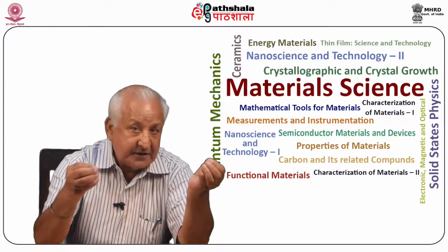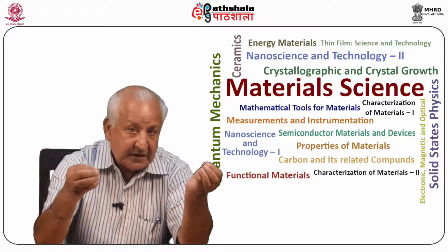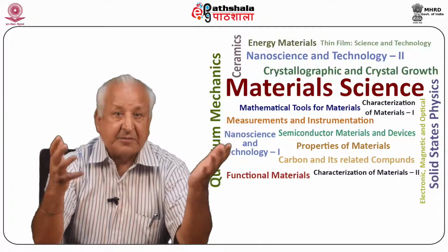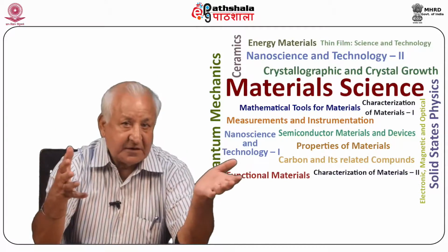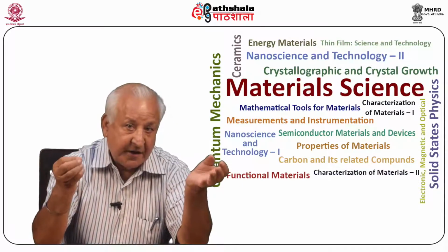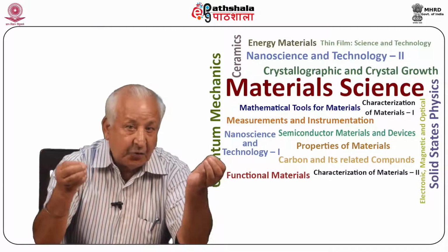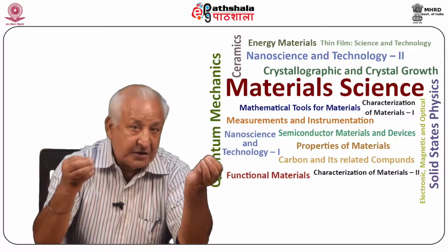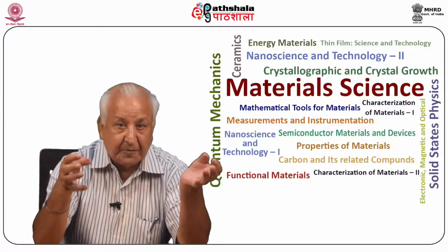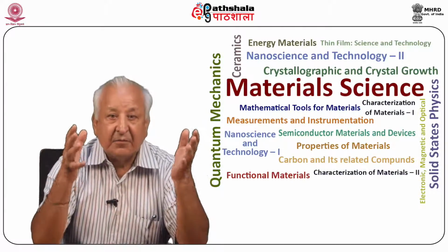The resolved defects generally observed by topography are extended defects like dislocations, inclusions, or precipitates, surface defects, long-range strains, growth striations, etc. We describe here a few examples and we would reveal the potential of X-ray diffraction topography in characterizing the crystal defects, and also in studying sources that may generate defects in otherwise perfect crystals.